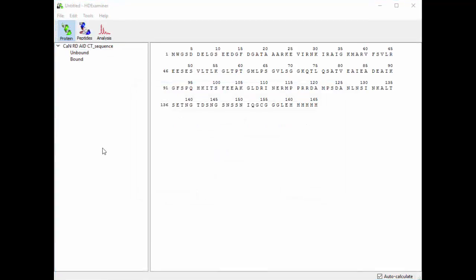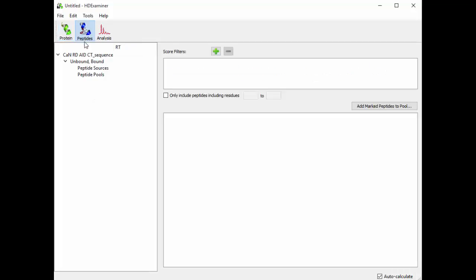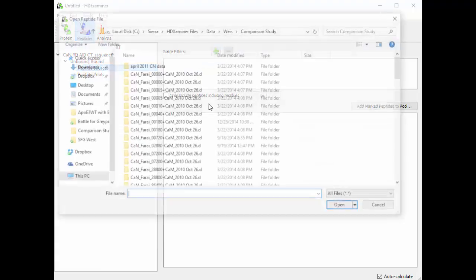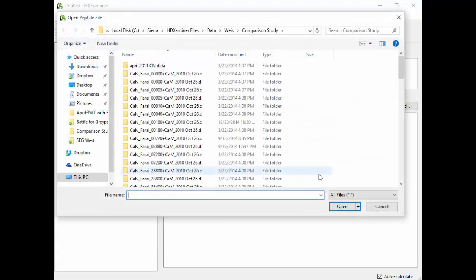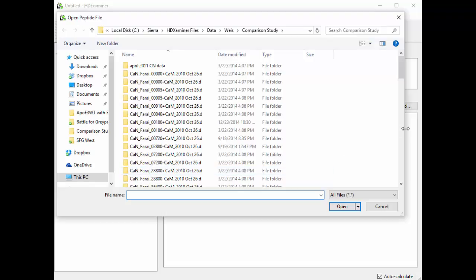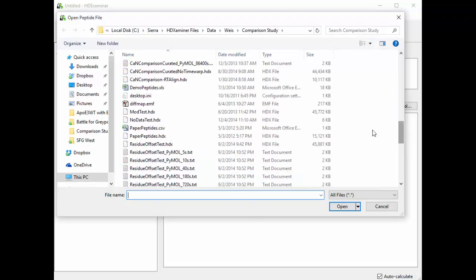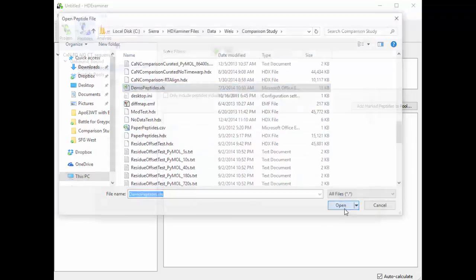So once you've imported your protein and set up your protein states, the next step is to import your peptides. So to do this, go to the peptides view, and here under Peptide Sources, right click and click Add a Peptide Source. HDExaminer can read peptides from a variety of different formats, including Sequest HTML, Mascot XML, PepXML, and even just regular tabular data, which is what I'll be importing here, an XLS file.